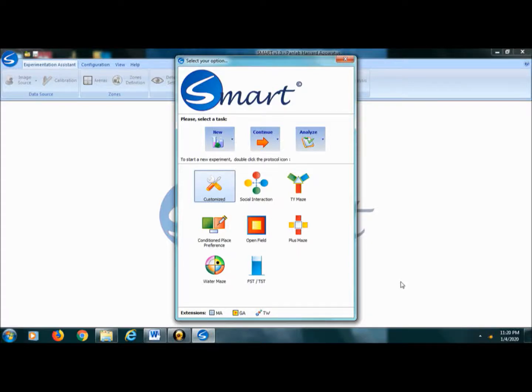Assalamualaikum and hi everybody. In this video, I'm going to show you how to analyze open field tests using Smart Software Tracking System.